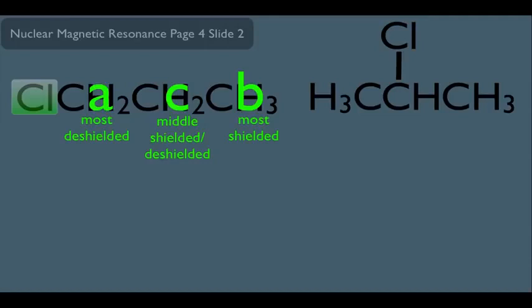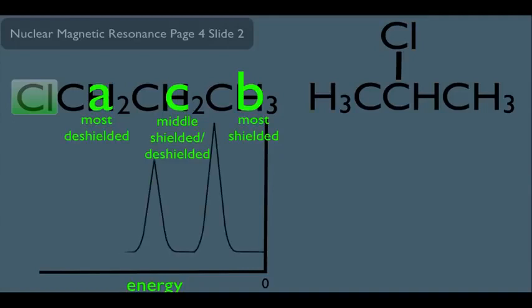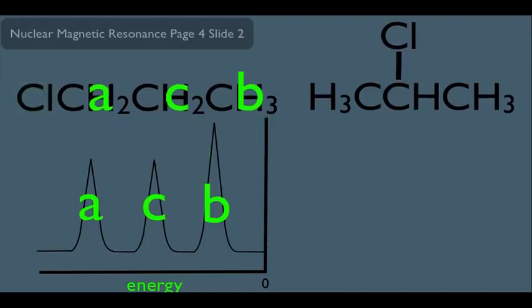Somewhere in the middle. Which means technically, for this molecule, you have 3 types of hydrogens and 3 different electronic environments. Which again means if we run this through the NMR and look at the data, we should expect to see 3 signals in the HNMR. Again, 1 signal each for bringing each one of these hydrogens, A, B, and C, into resonance. And why not? Let's label them. Remember, this would be our A hydrogen peak, the most de-shielded. This right here would be the B peak, the most shielded. And then remember, C right here would be in the middle of them. So that's what we would get out of the HNMR for that molecule.